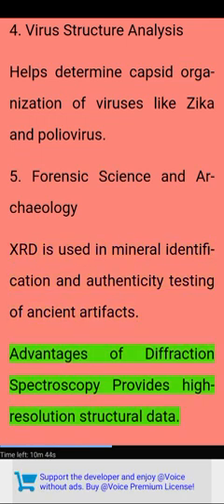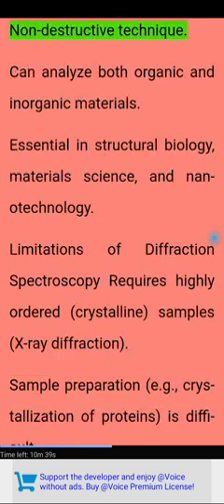Advantages of diffraction spectroscopy: provides high-resolution structural data. Non-destructive technique. Can analyze both organic and inorganic materials. Essential in structural biology, materials science, and nanotechnology.